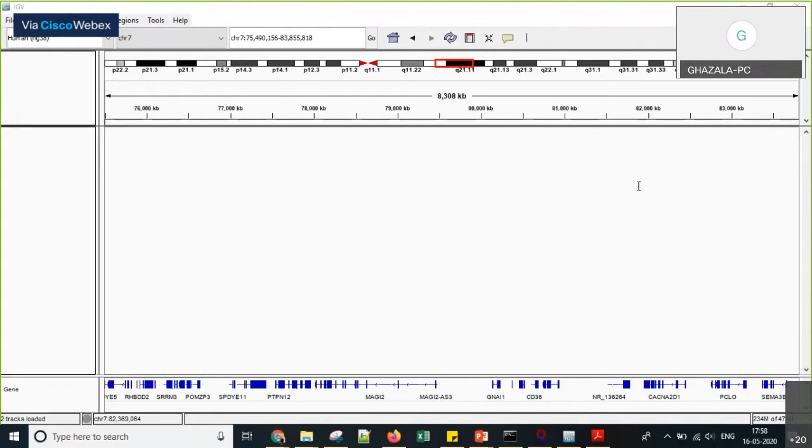In GRCh37, they are included as the gene name with a location name, for example LOC. You can also check in the reference when you download it in GTF format. Yes, the reference genome annotation file format is GTF. You can check there that some of the gene names are given as LOC followed by a few numbers, because those genes were not yet discovered then. After that, a few genes became known, got discovered and were given their names. That's how we use a newer reference genome, for example GRCh38, because there we have more accurate gene names, rather than missing genes named as LOC or something that is not exactly the gene name we are looking for.